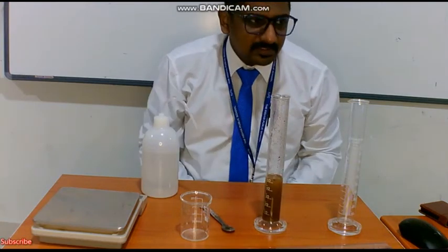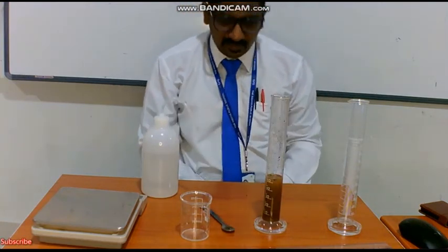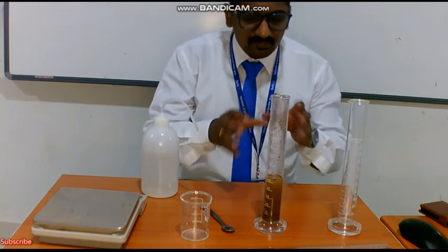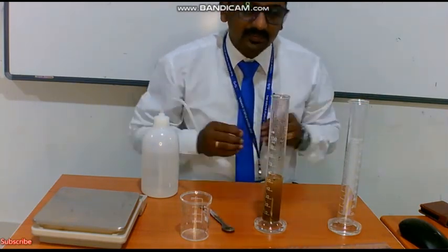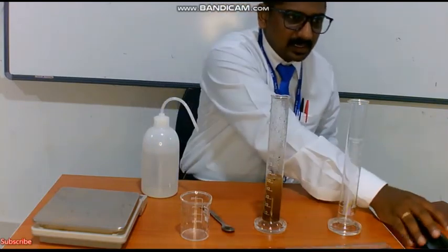You have to mix it properly and leave it as such. How many minutes? Keep it for half an hour. So we wait for half an hour, and before that we will do some theoretical work.